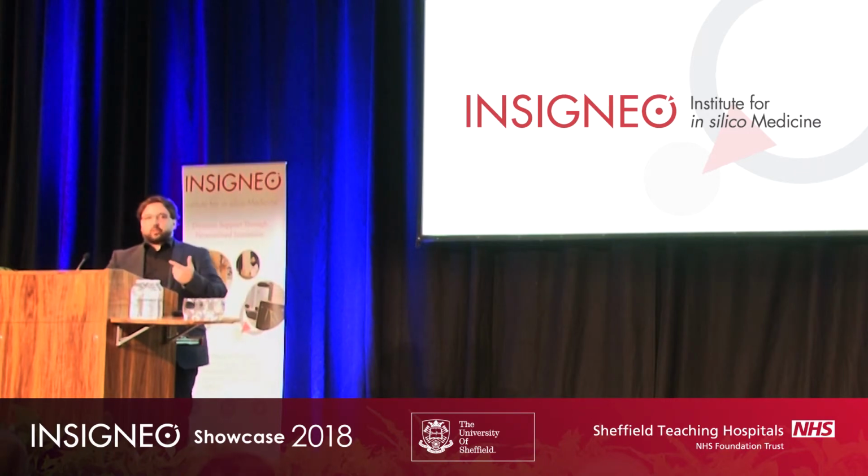Another application, in particular for the modelers, is that we can use this information to validate the output of computational models, in particular what I will call micro-finite element models, which are finite element models generated directly from micro-CT images. The concept is pretty similar. From the undeformed condition, we can generate our finite element model with a large number of degrees of freedom, and then we can simulate the same loading that we applied in the jig, and then compare the output with our digital volume correlation methods.